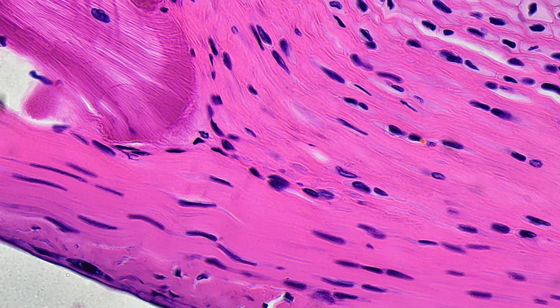Identify the tissue over here. Now we can see this wavy looking appearance roughly going from left to right as it transitions right here into a different tissue type. The wavy appearance continues this direction. This is actually a junction between a muscle and a tendon. So right here we can see some striations or lines that run perpendicular to those fibers. This is actually a muscle tissue of some sort.